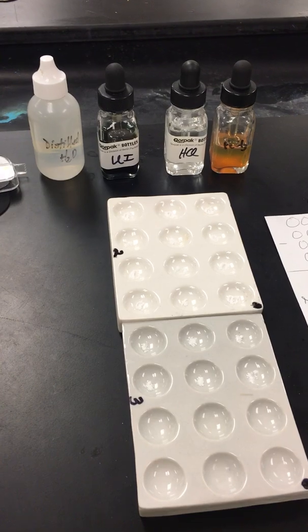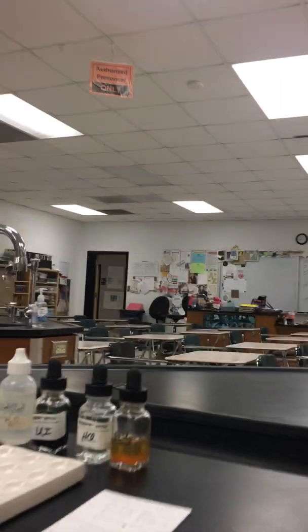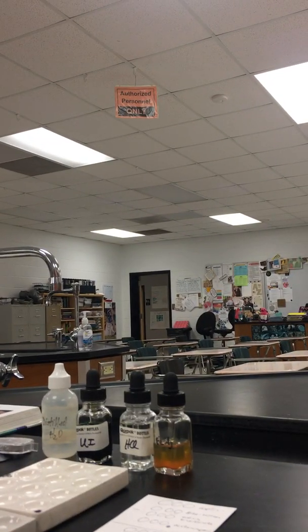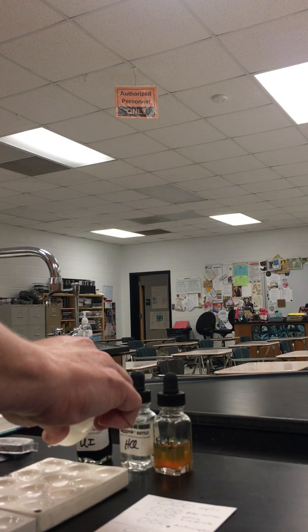So what I'm going to go ahead and do now is add the distilled water, and then I'll show you what we have. So distilled water is going to go in this first column. I'm going to add enough.